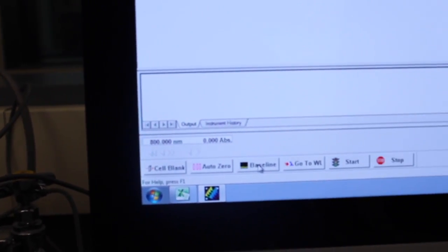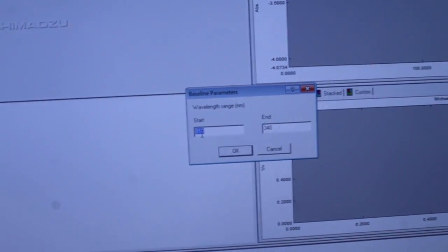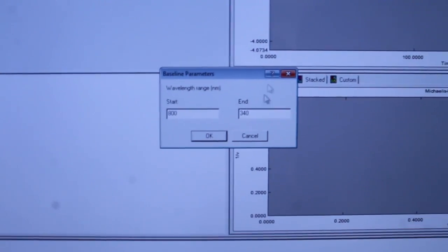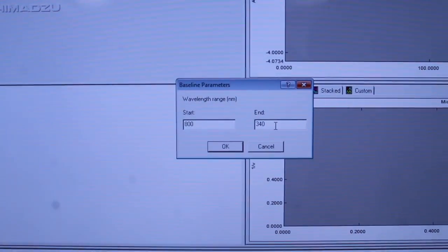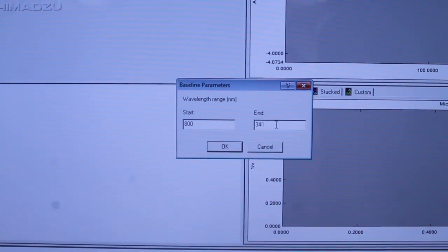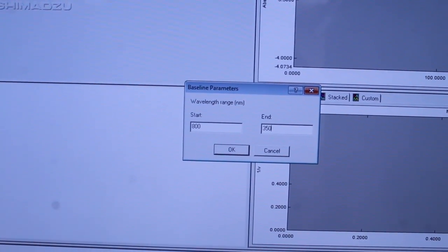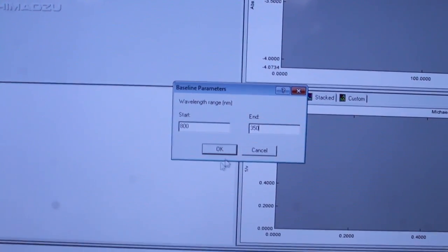Now, click the baseline button on the bottom left part of the screen to start ensuring that your wavelength baseline parameters are uniform. Click OK.